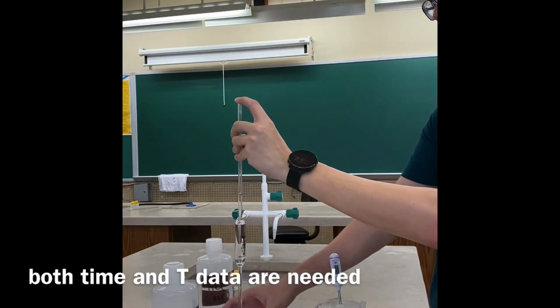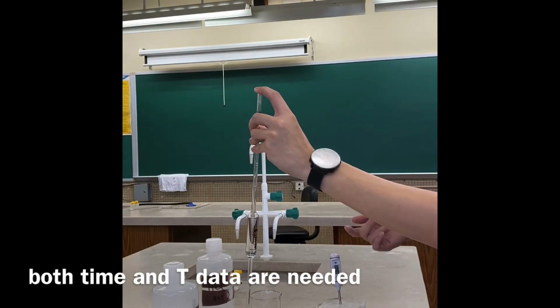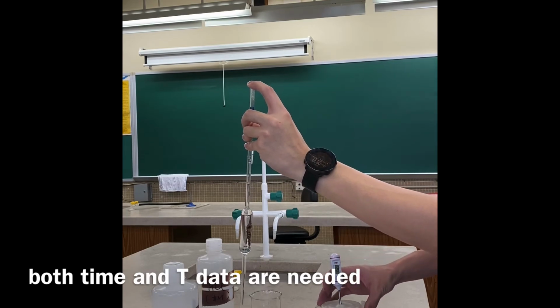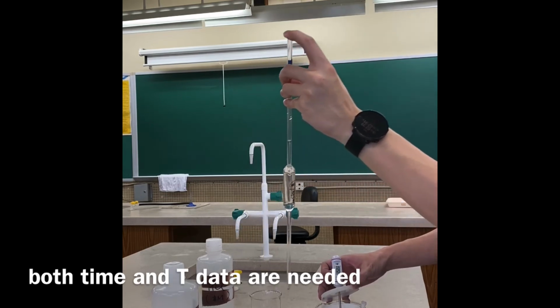At exactly 3 minutes, you have to add this amount of alkali into the acid, and at that particular moment you cannot measure the temperature. However, after the addition of the alkali, you have to measure and record the temperature every 10 seconds for the first several minutes. So let's see the result.